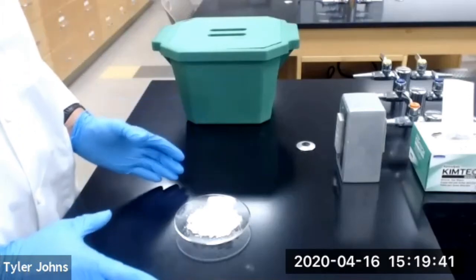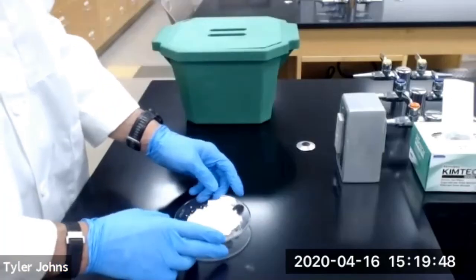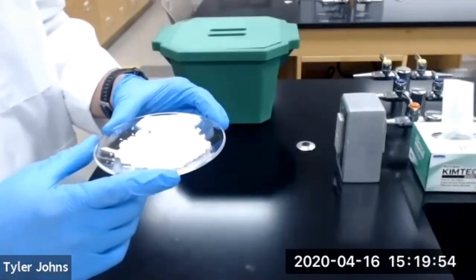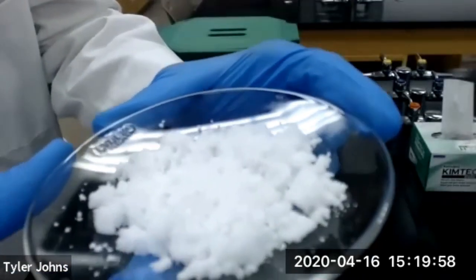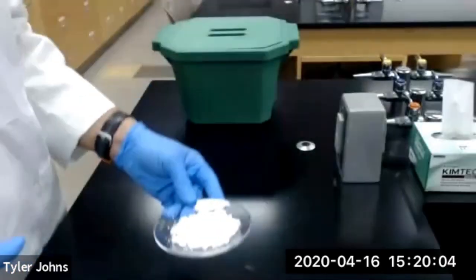Okay, so after filtering, I've gone ahead and transferred my alum crystals to a watch glass, and I'm going to let them dry before I determine the mass recovered of the alum. You can see my crystals are right here. Hopefully you can see those. That's the alum crystals. And we're just going to let this dry.